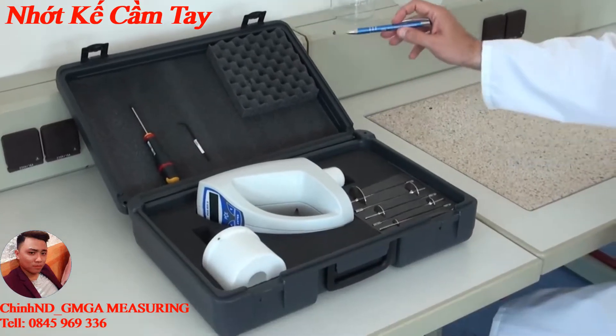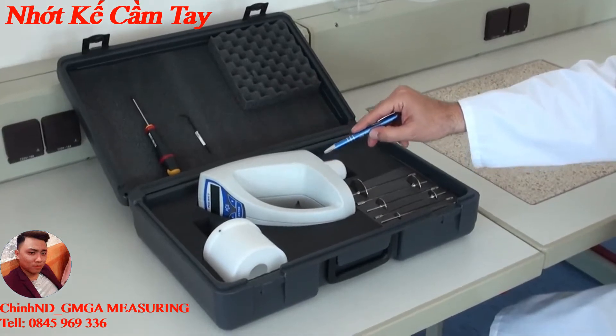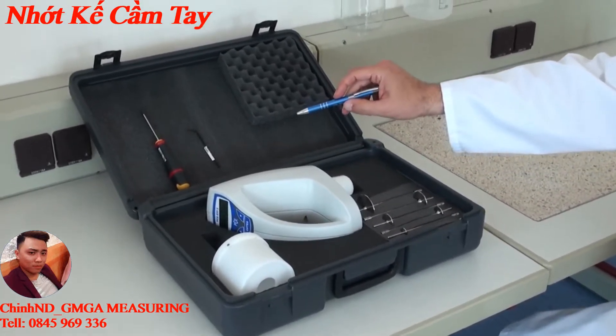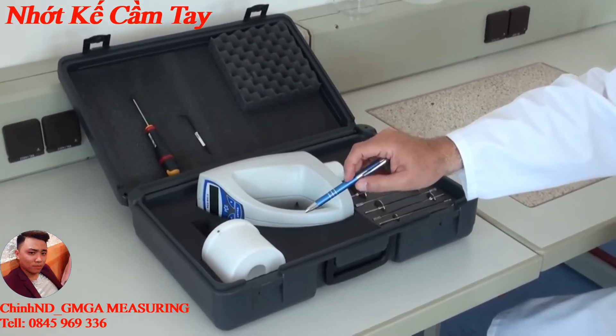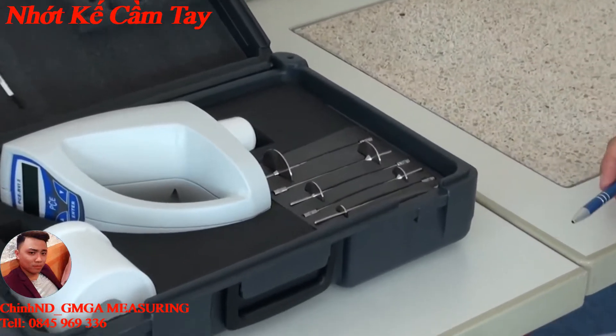The device is delivered in a transport case and consists of the fiscometer itself, four alkaline batteries, installation material, a screwdriver and the allen key, as well as a protection for the rotation bodies and a set of rotation bodies.